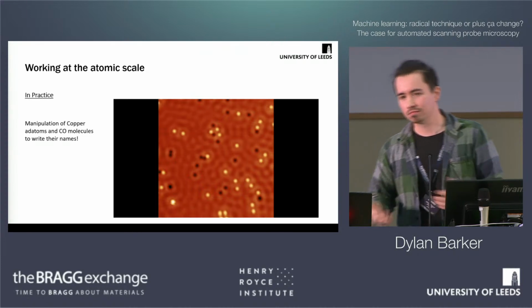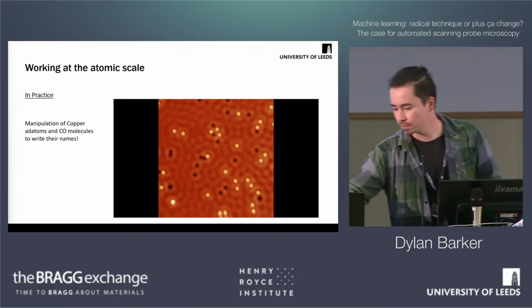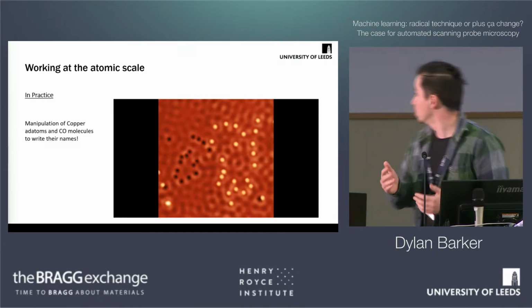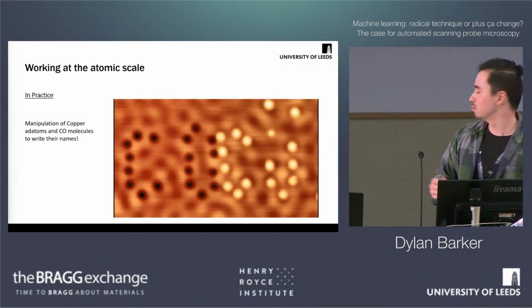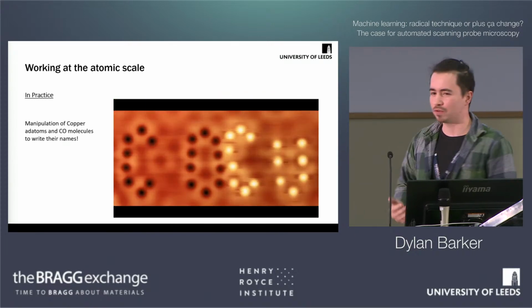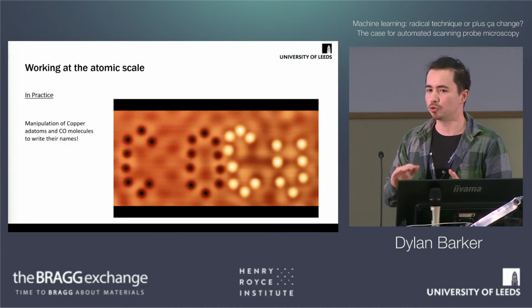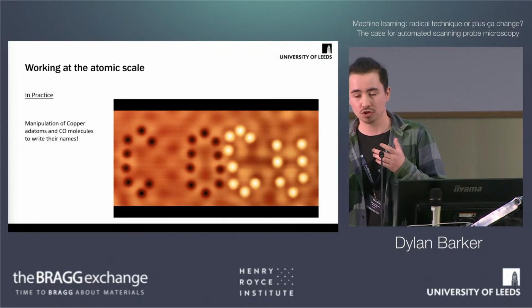So I've shown you how STM works, roughly. But, you know, what kind of stuff can we do with it? So here's just a quick video showing a manipulation event, moving some atoms and molecules around on a surface. This one's just for fun, just to write CO-Cu. But there's other stuff we can do. We can build very specific structures for our experiments.